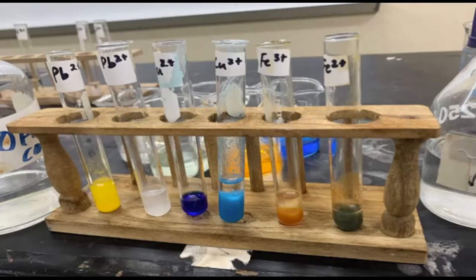Metal ions, also called cations, can be identified using the flame test since each gives a characteristic color. Metallic cations and the ammonium cation can also be identified by the formation and appearance of their hydroxides by adding aqueous sodium hydroxide and aqueous ammonia to solutions containing the ions. This is what we will explore in this video, as well as the test for some common anions and gases mentioned above.